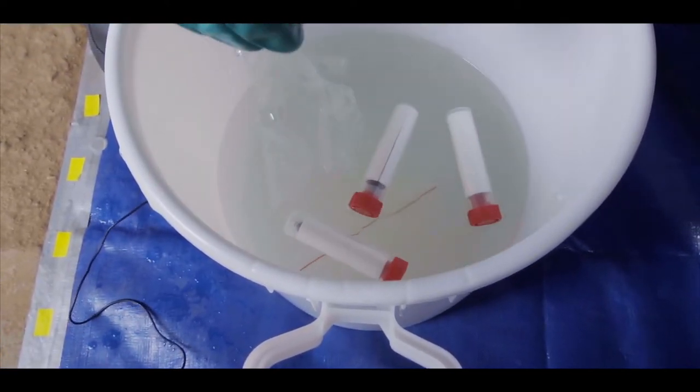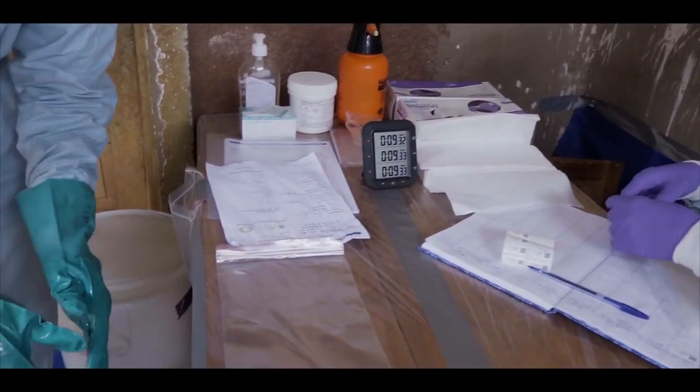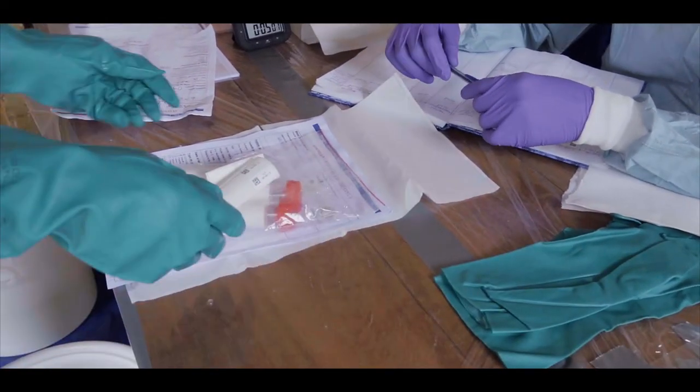The samples must be immersed for ten minutes. In the meantime, as those ten minutes take place, we do documentation, and then the sample can go inside.